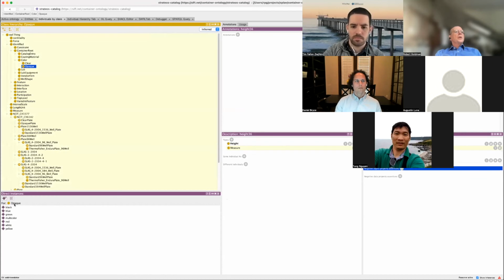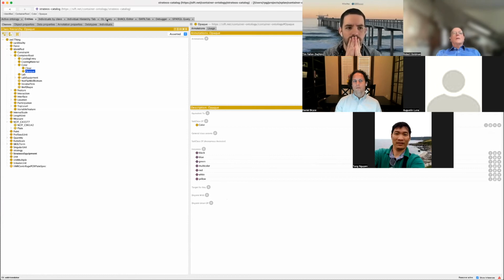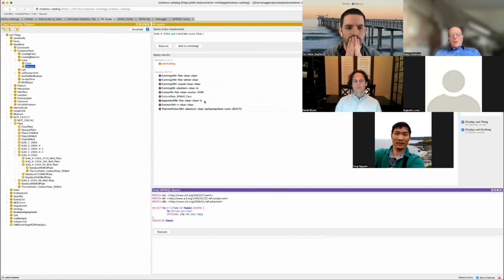And actually, if you look, some of these vendors make them in colors, and maybe somebody wants to color code the pieces of the protocol. I don't know if this is going to actually work.